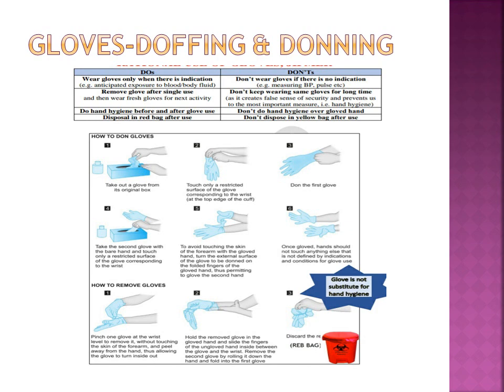So the first glove you have to put inside the other glove, and then put it in a bin, and then hand hygiene.